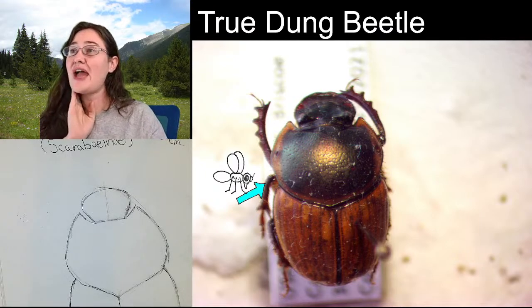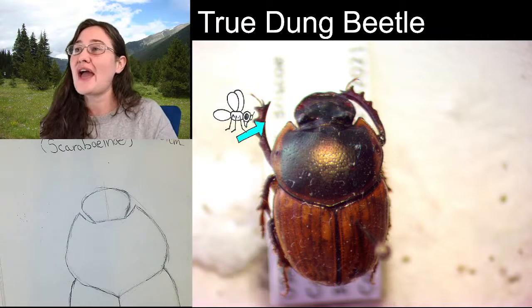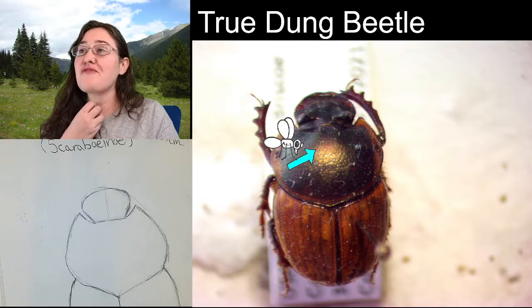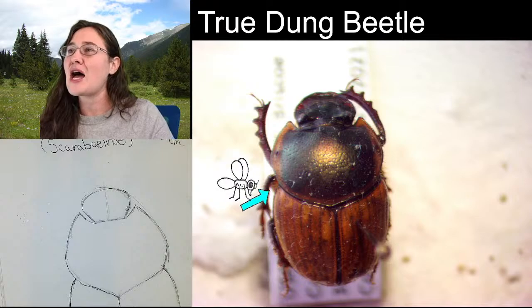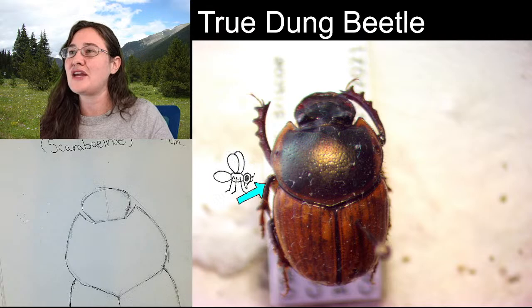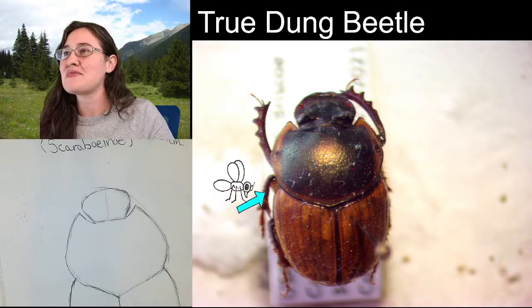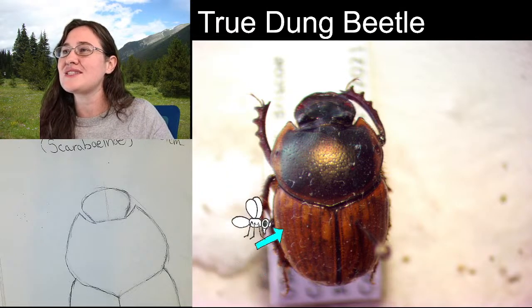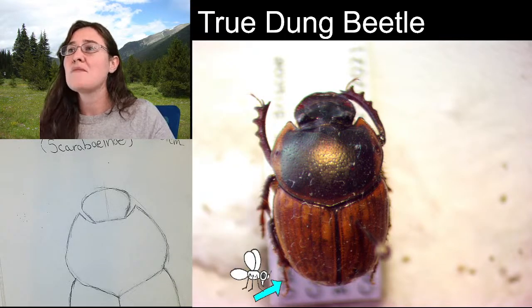I'm going to look at our leg shape here. And what we're looking at here is actually the tibia. The femur is pretty short and stubby, so you can't really see it. On the middle leg, you can almost see it. It's that little wide guy right there before it bends here. So that little guy right there is the femur. And then this wide one here is the tibia. And then that's the same for down here. You can see the edge of the tibia and maybe a little corner of the femur, but that's about it.